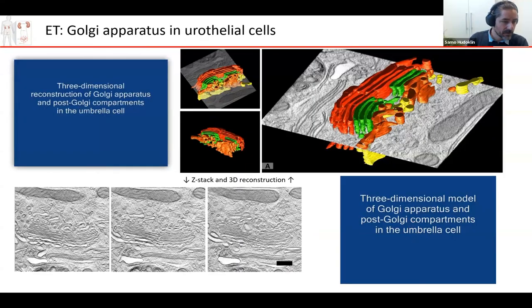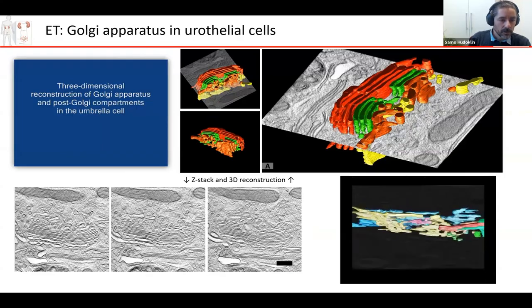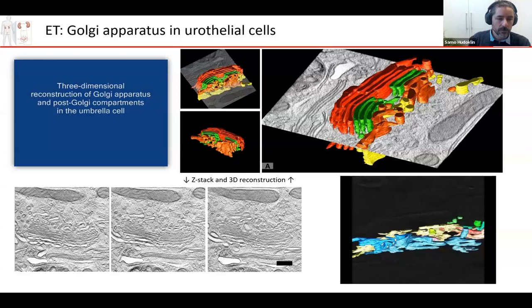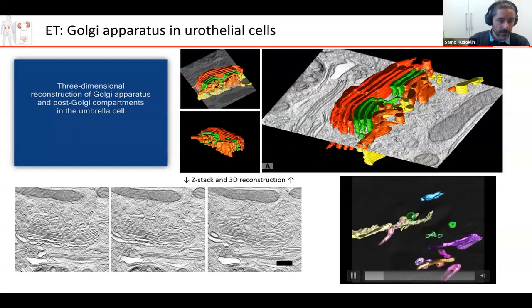Based on those reconstructions, we then did the modeling of the Golgi, the trans-Golgi network, and all the compartments that lie after the trans-Golgi up to the fusiform vesicles.